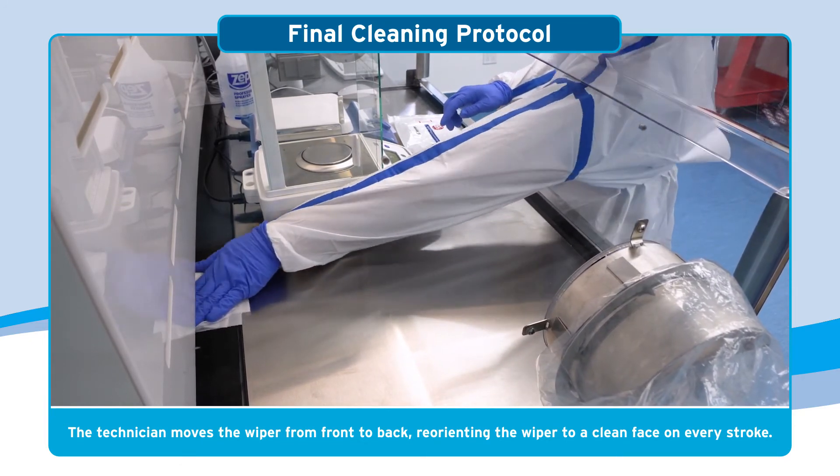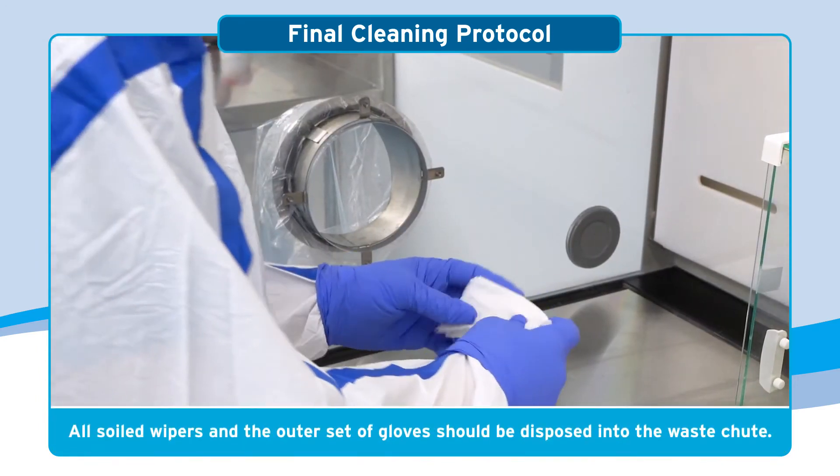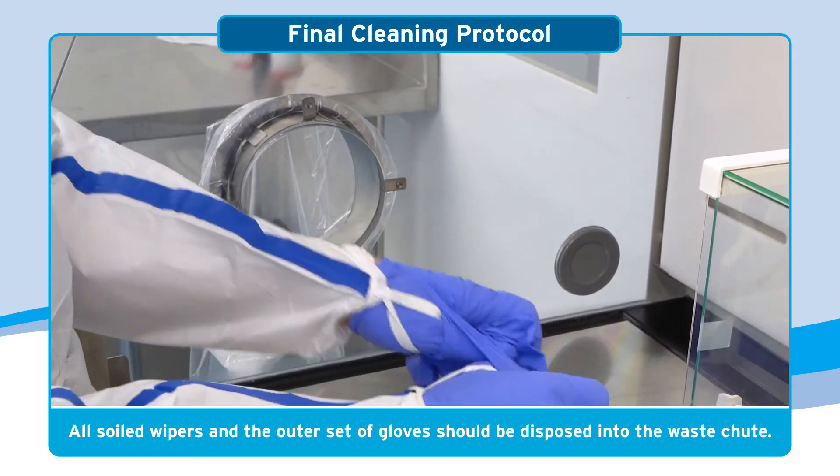This allows for maximum absorption and cleaning efficiency. All soiled wipers used during the cleaning procedure and the technician's outer set of gloves should be disposed into the CVE's waste chute.